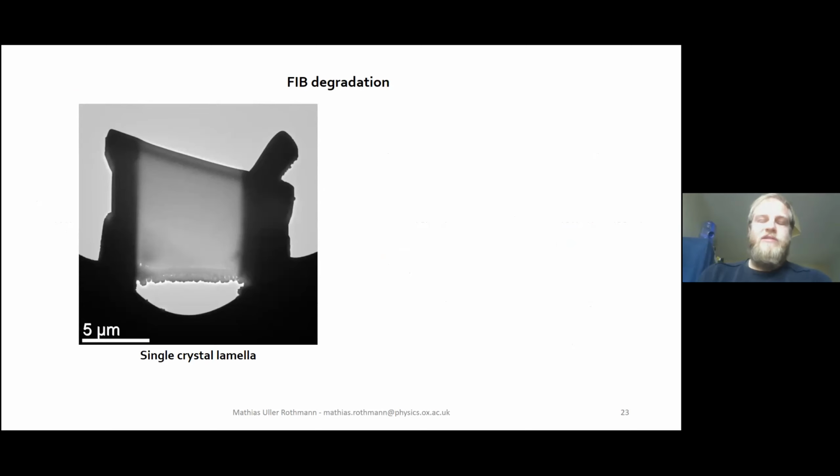Typically around 100 nanometers, you can do down to 50 nanometers. It's very, very cool if you want to look at devices, but it's kind of analogous to digging a hole by firing a machine gun into the ground. You can dig the hole, but you have a lot of bullets going in, you have a lot of gallium being deposited, and you might actually damage the structure that you're looking at.